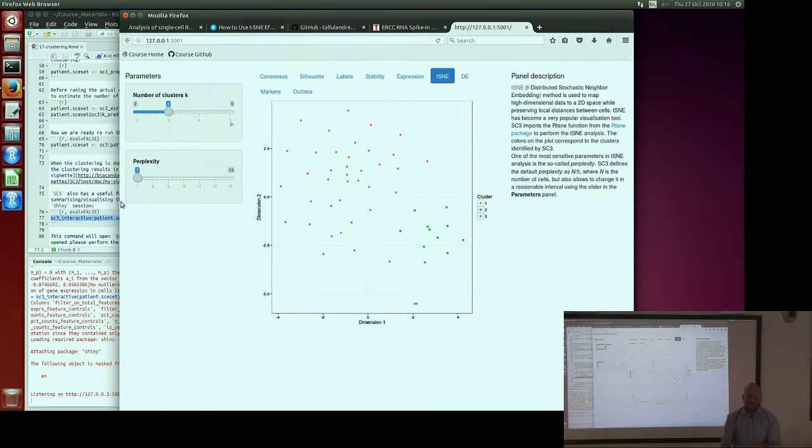Well, yeah. So your range factor is small. Yeah. So this range is actually the default range. I don't remember how we calculated it, but I think for smaller data sets, tSNE is usually always homogeneous. So unless you have really strong clusters in your data, it will always look like that.